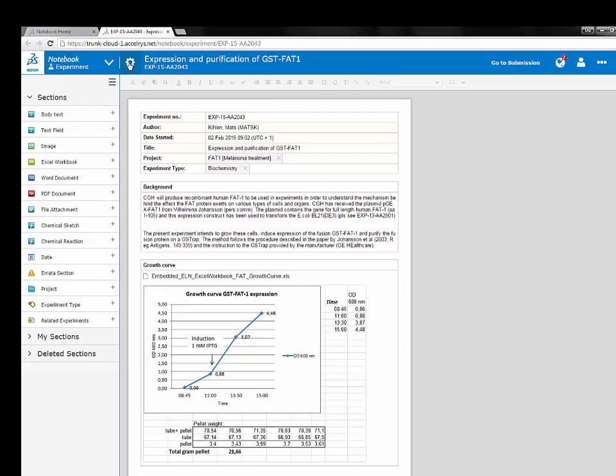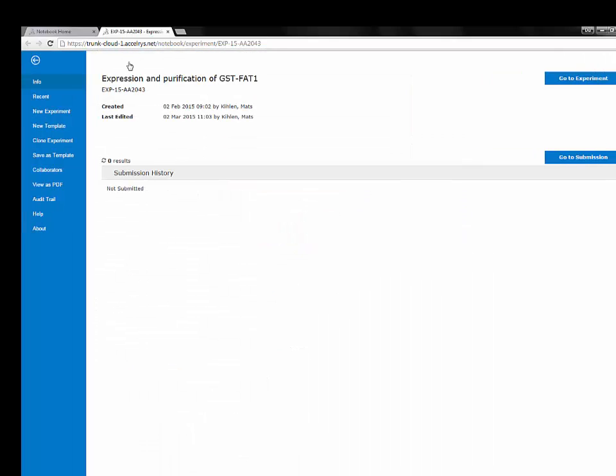The experiment and template editors are very similar to how they were before. The old menu bar at the top of the experiment has now been replaced with the cogwheel. Here you can find the experiment properties, the ability to save as a template, view as PDF, and much more.